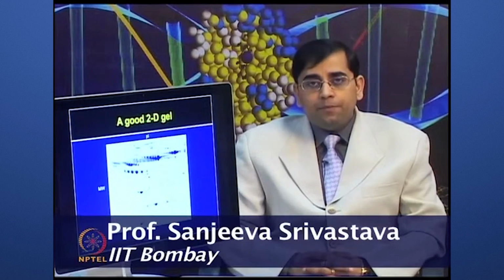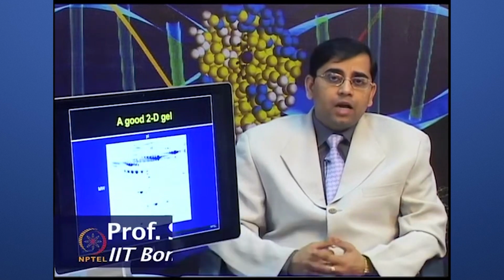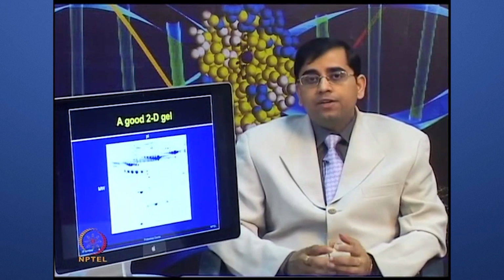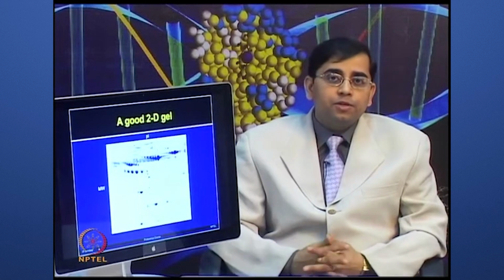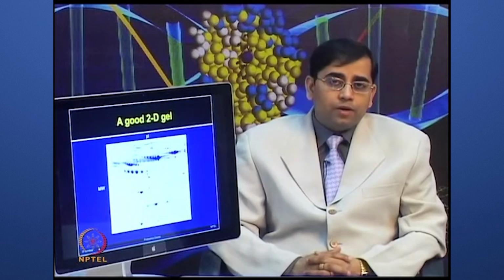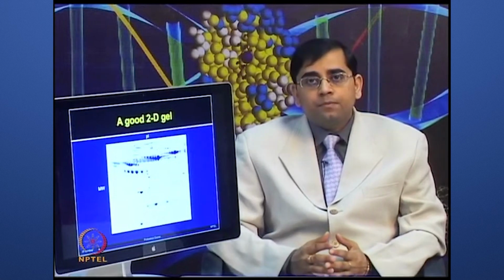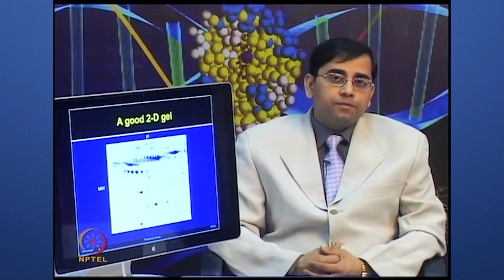Now, we will talk about different image processing tools, how to first prepare the images for data analysis, and then how some of the commercially available software can be used for obtaining very meaningful information from these gels, whether you can see some differential regulation of the proteins, upregulation or downregulation, or you may have some unique proteins emerging in your sample type or treatments. These analyses will be performed on the software, followed by statistical analysis to obtain confidence in the data, how meaningful this information is, and whether I can proceed with this spot for further protein identification using mass spectrometry.